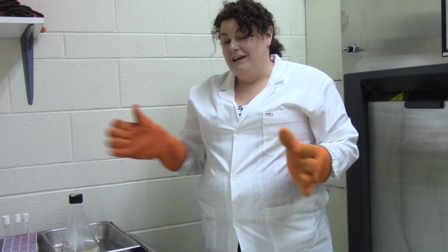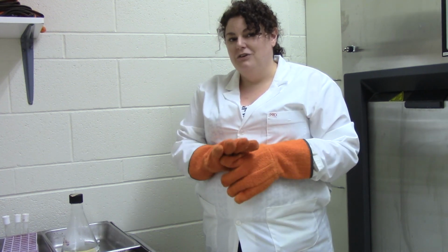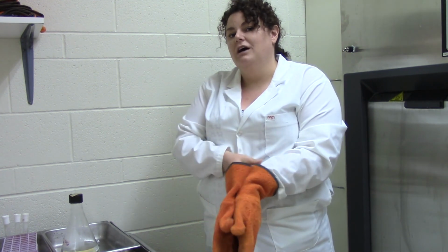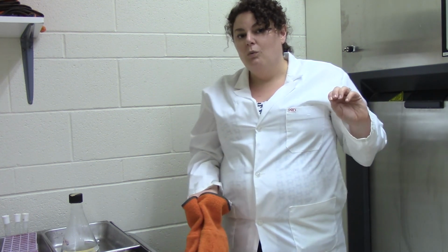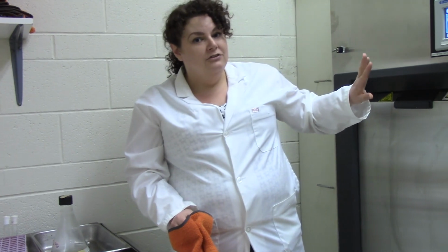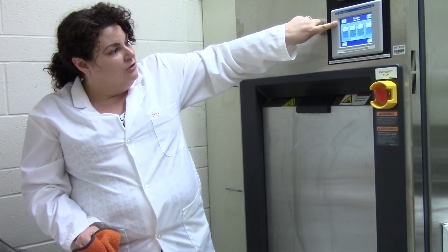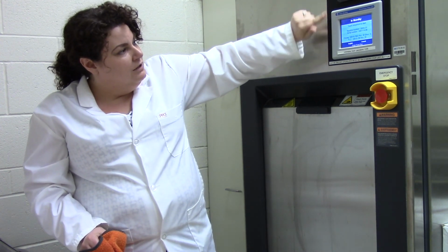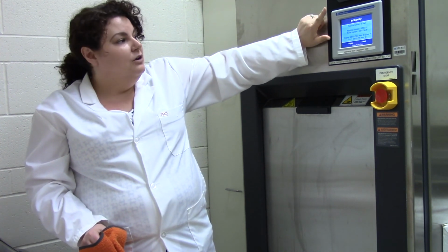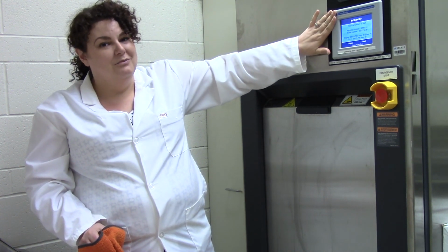All right, that's the introduction to the autoclave. Hopefully you've got your key tips for how to keep things safe and how to safely use this piece of equipment. One last thing, if you're the last user on the autoclave, there's this power button right up at the top here. It doesn't actually shut it all the way down, but it does move it to standby. So if you're the last user, make sure that the autoclave moves into standby mode.